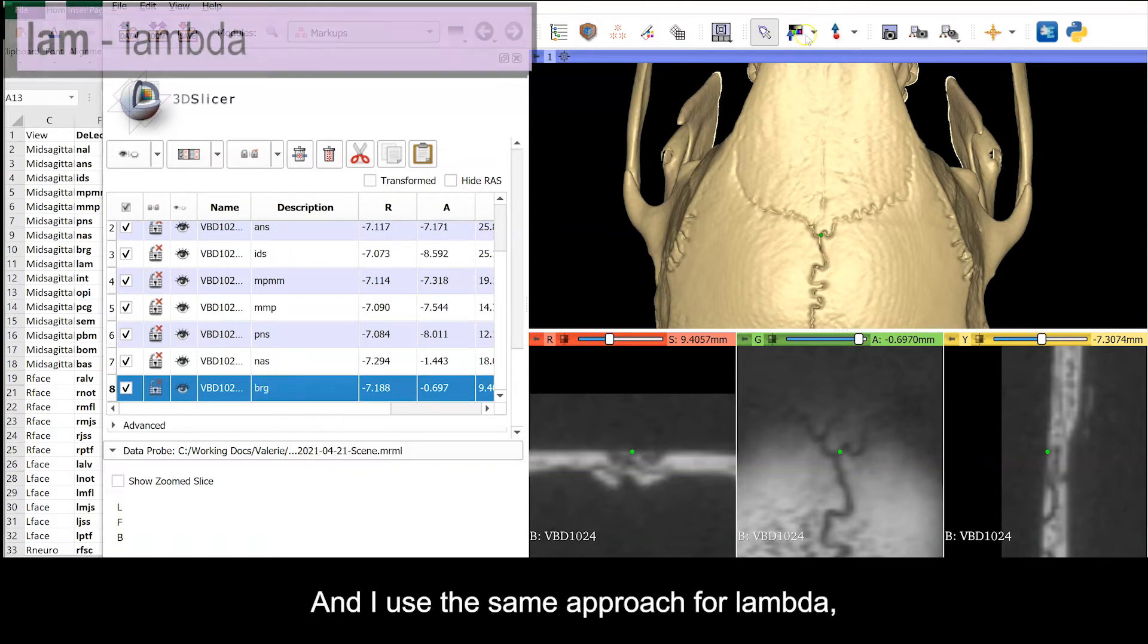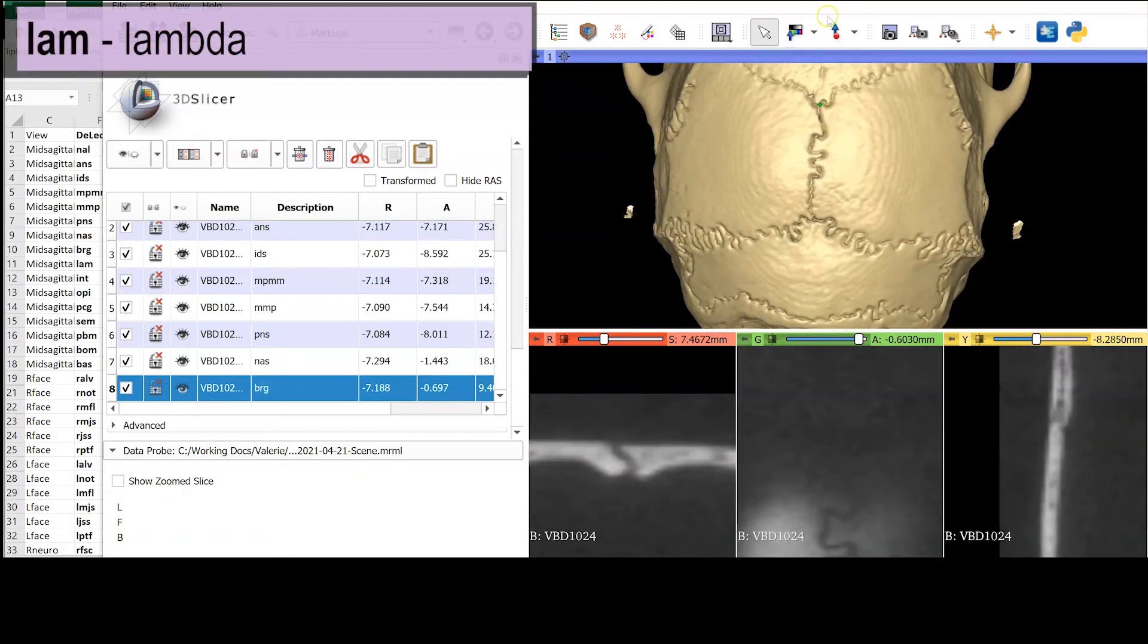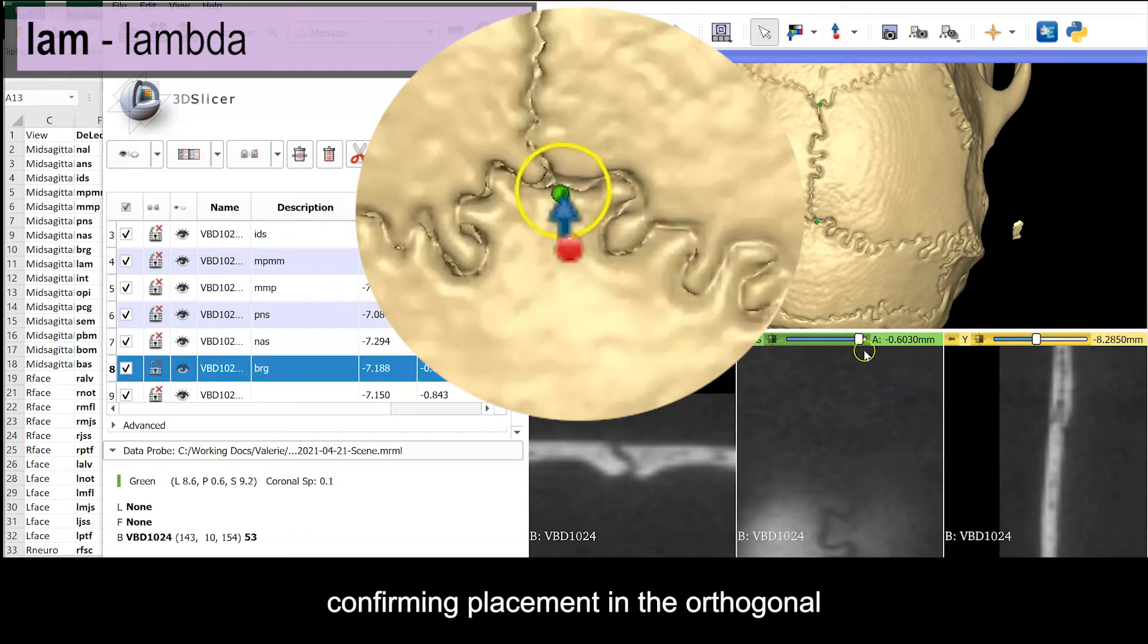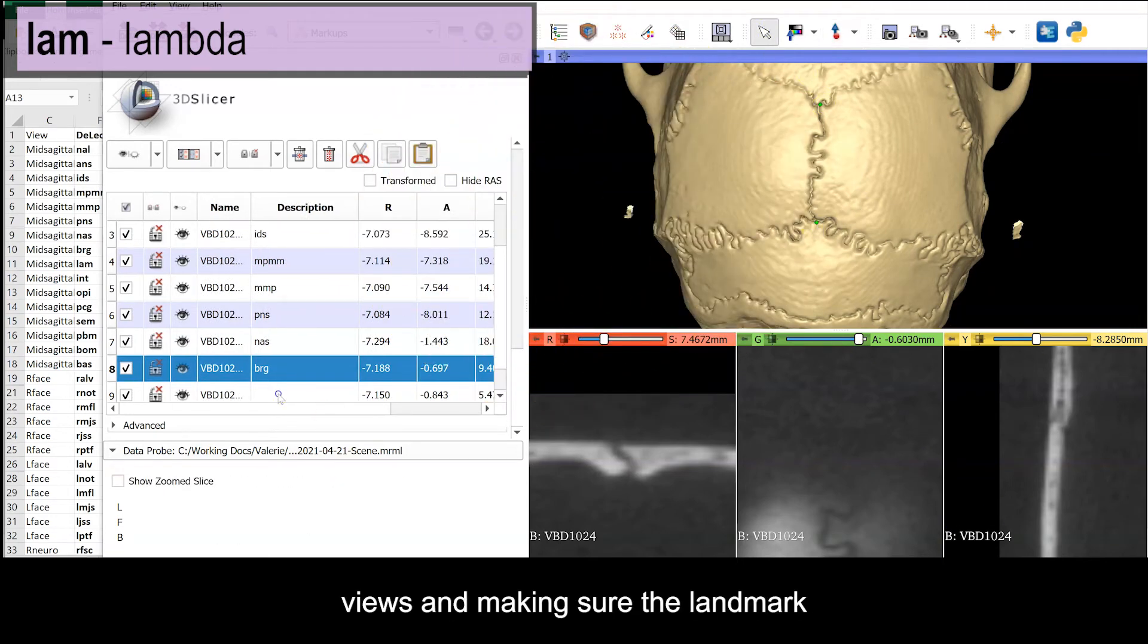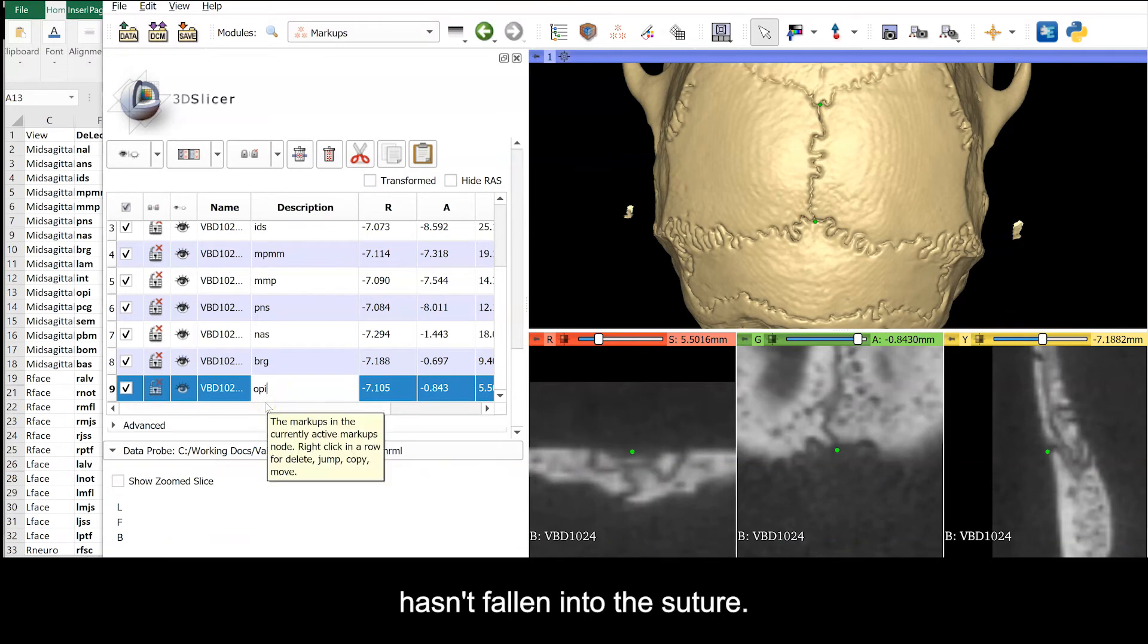And I use the same approach for lambda. Confirming placement in the orthogonal views and making sure the landmark hasn't fallen into the suture.